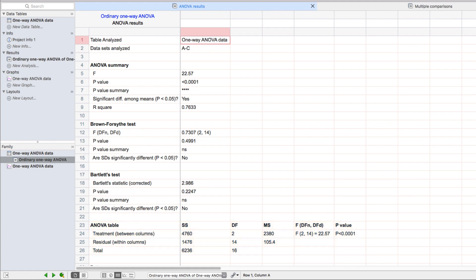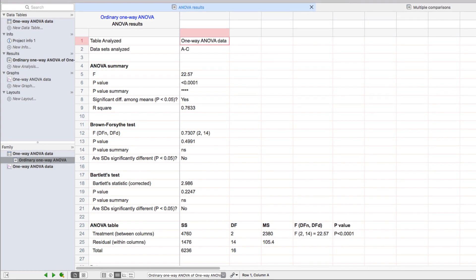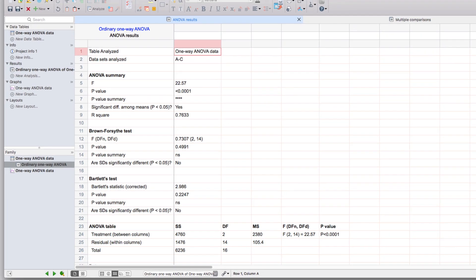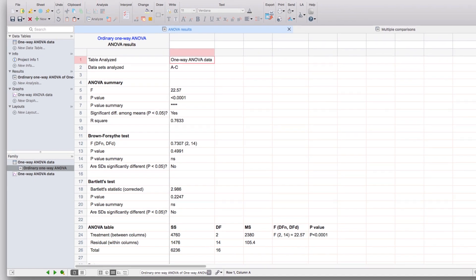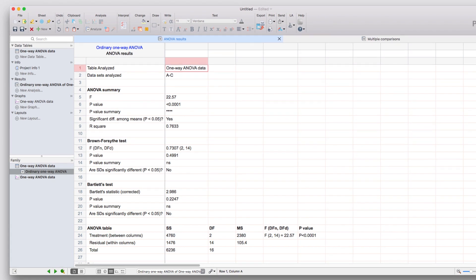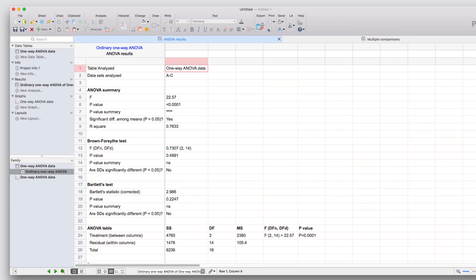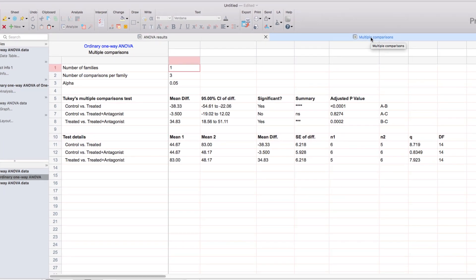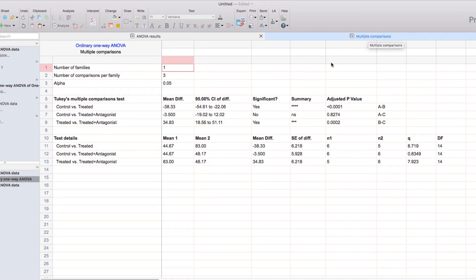Those results are found on a separate sheet. Each analysis that generates more than one sheet of results will display those results as a separate tab. Here you can see the tab for multiple comparisons can be found next to the sheet for ANOVA results. When we click on the Multiple Comparisons tab, we'll be shown the results of the comparisons between specific pairs of groups that we identified in the Parameters dialog.